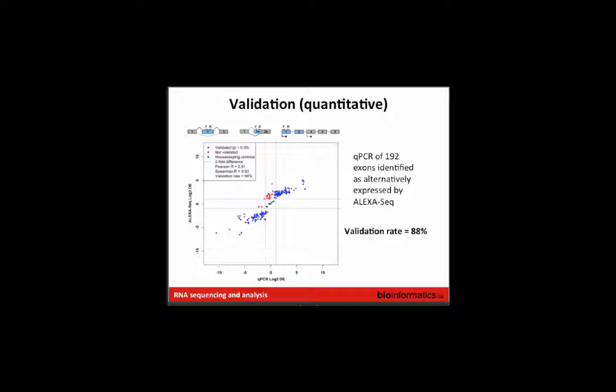And this was based on what is now quite old RNA-seq analysis and RNA-seq library strategy and sequence length. All of these things are better now. So this is really a lower estimate. You can get very, very good predictions out of RNA-seq.